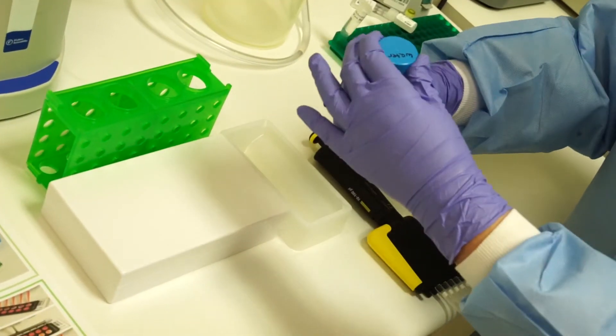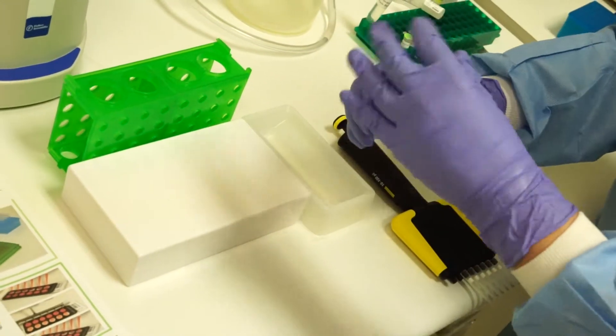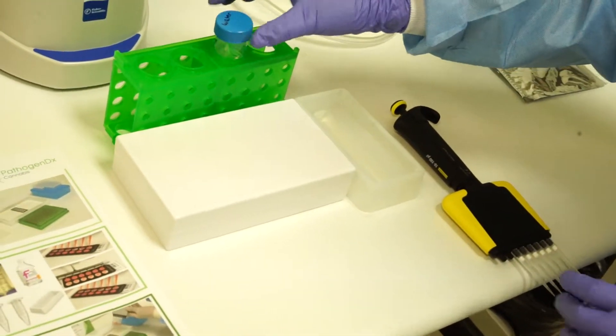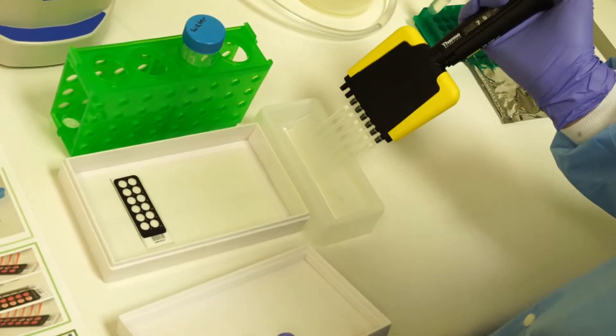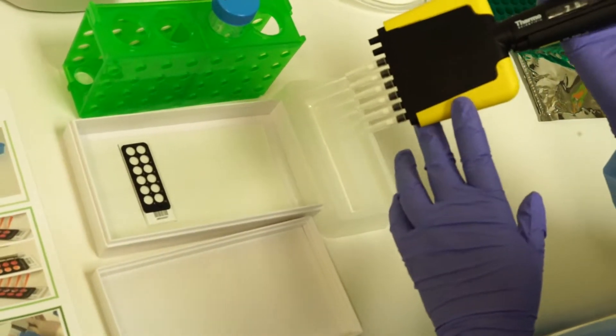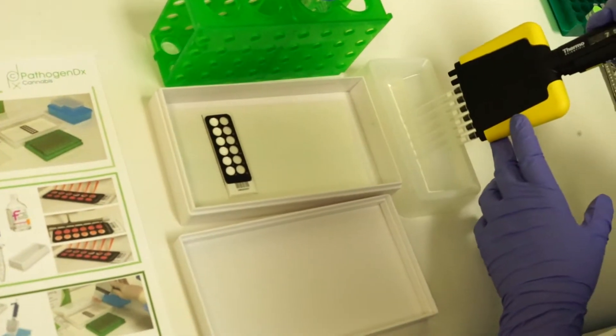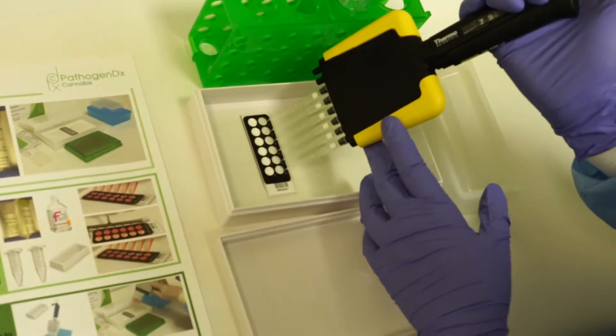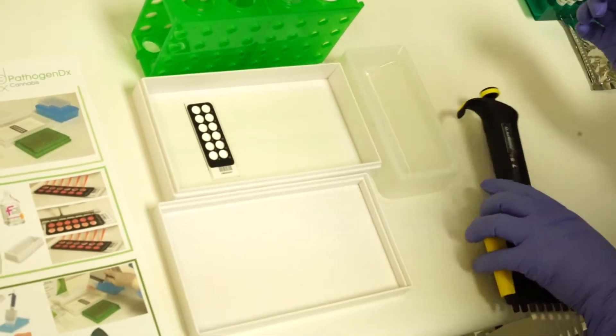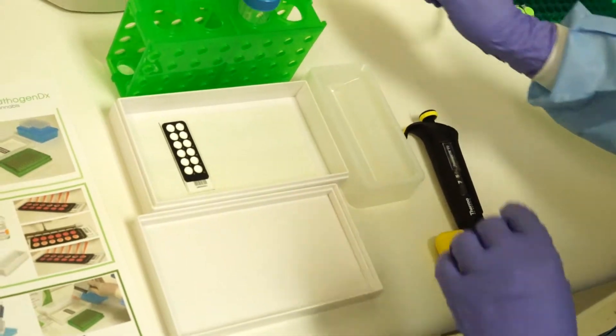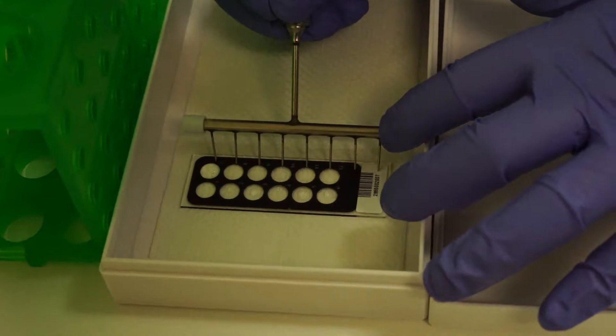When you are ready to begin the hybridization, pour your molecular biology grade water into a pipette basin. Your pipettor should be set to 75 microliters for the first wash step. Once you have 75 microliters, carefully dispense onto the slide. Make sure that no contact is made between the surface of the slide and the end of the pipette tip. After you've dispensed your first 75 microliters, aspirate and repeat, allowing the water to sit for five minutes.